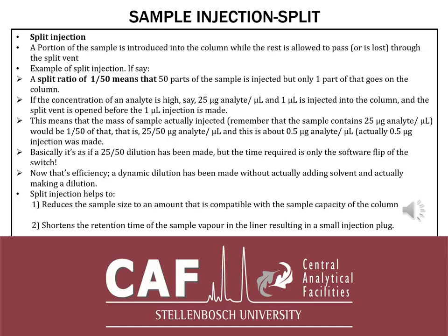For instance, I always ask a question in interviews. I give a chromatogram with a lot of peaks which are not resolved to baseline, and I ask, is that one peak or is that more than one peak? The answer can be one peak, it can be 2 peaks. And I say, but how will you determine if it's one or more than one peak?